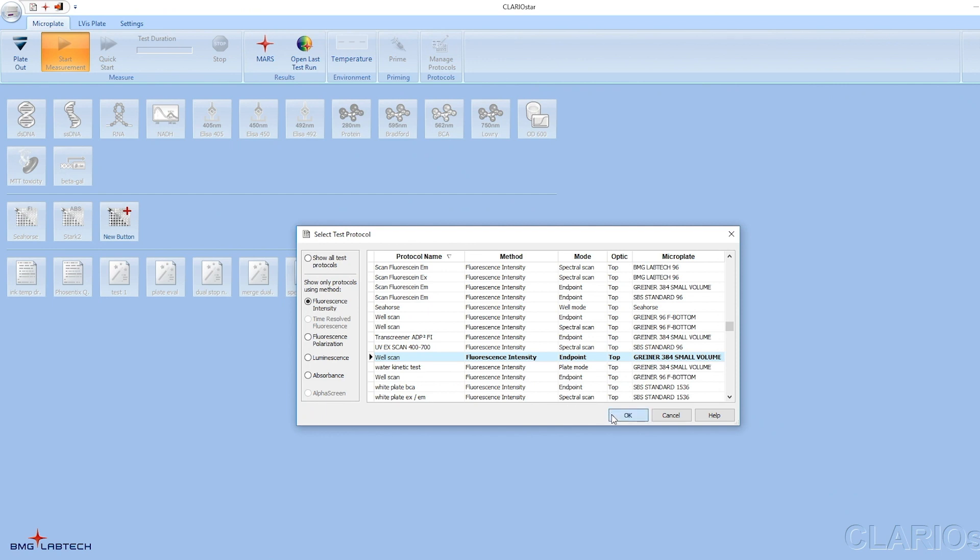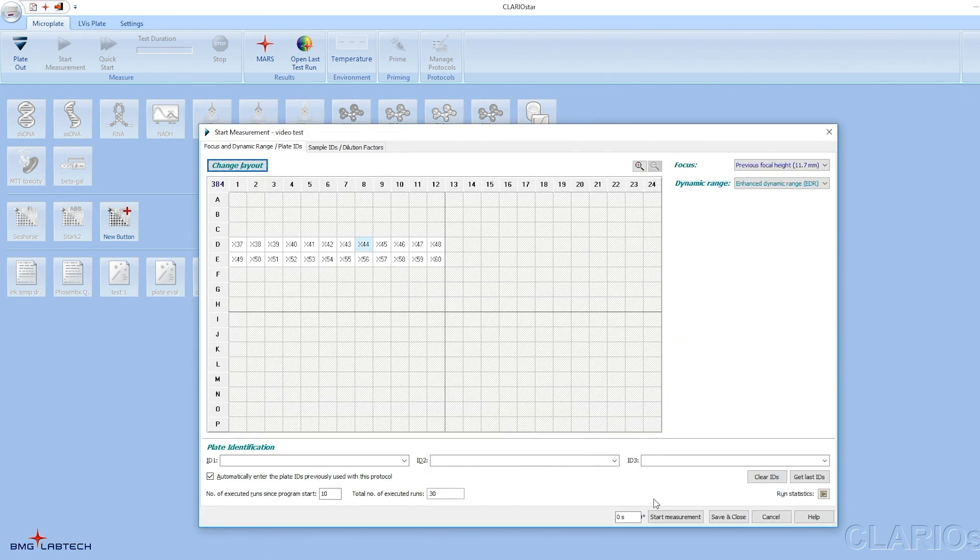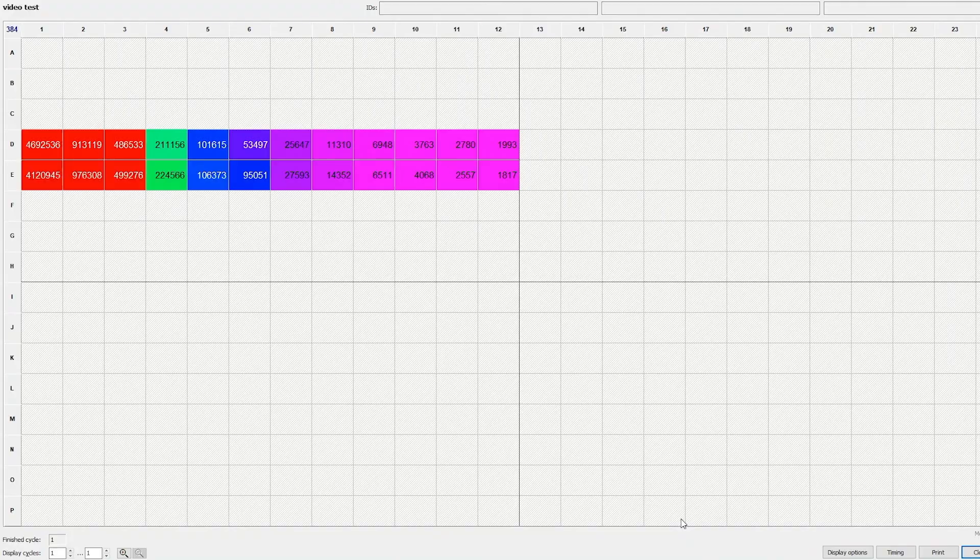For almost any test, users can read a plate without any optimization steps. EDR uses the best settings for every plate.